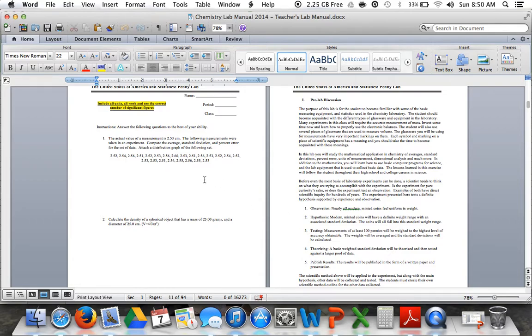All right? The density with the meter stick is slightly different. You're going to measure it in millimeters or centimeters. I recommend millimeters. Millimeters just gives you more sig figs. All right? So here, we've got 25.0 centimeters. And now you see that's the diameter, right? And our volume equation is 4/3 pi r cubed. All right? So just think for a second. 4/3 pi r cubed. Is that going to differ from our pennies? Yes, it will, right? Because our pennies are technically our cylinder.